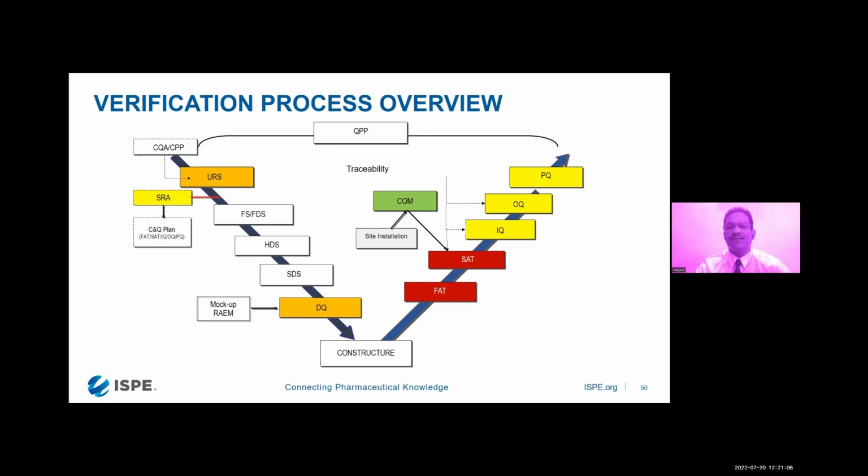It should take into consideration the process and all the parameters and operations that you're going to handle in the isolator. Because the isolator design and the isolator controls, everything will have to be properly defined as to what type of levels you want to achieve.